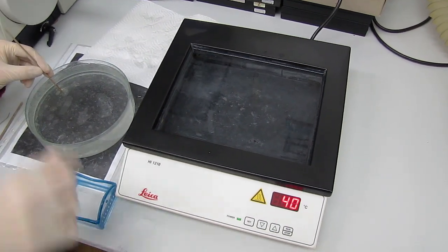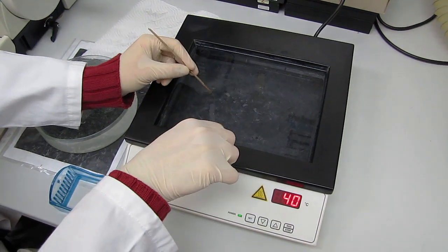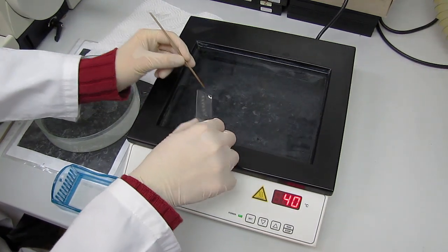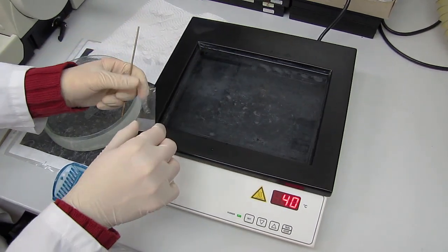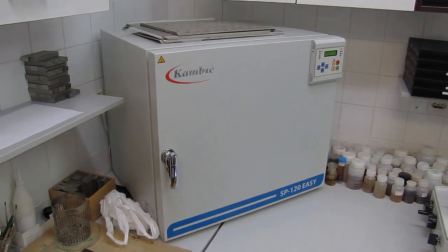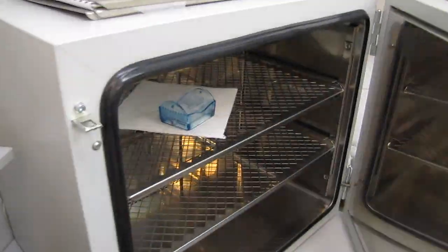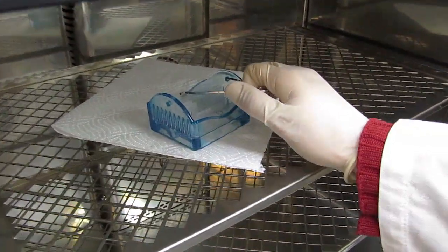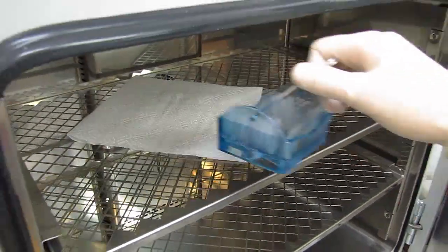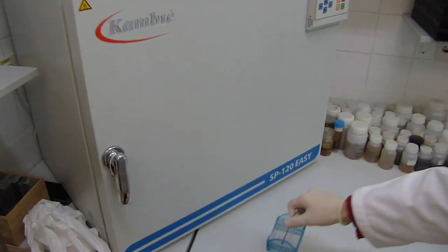It is important that the transfer of sections to the object glass is done as quickly as possible, otherwise glycerine albumin is washed away. Then the samples should be heated in a dryer up to 70 degrees Celsius in order to ensure the best adhesion between the sections and object glass. When this process is finished, let the samples cool off before proceeding with further steps.